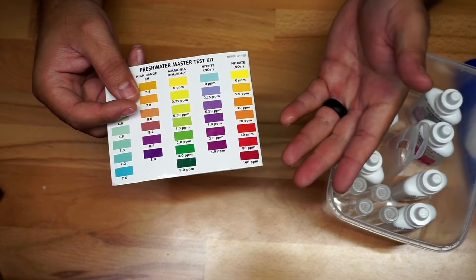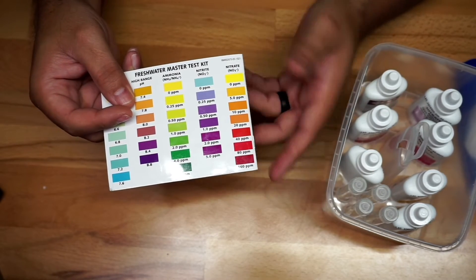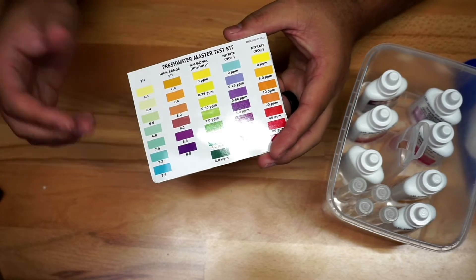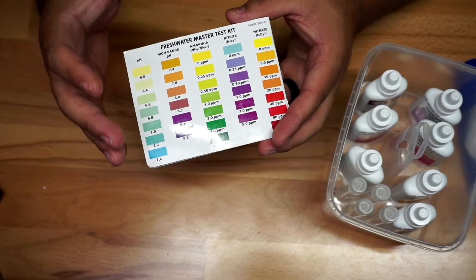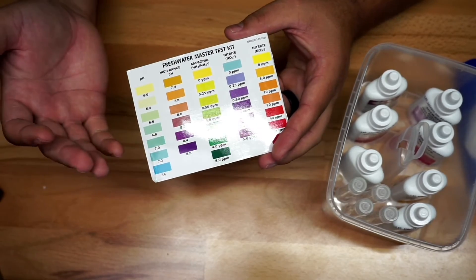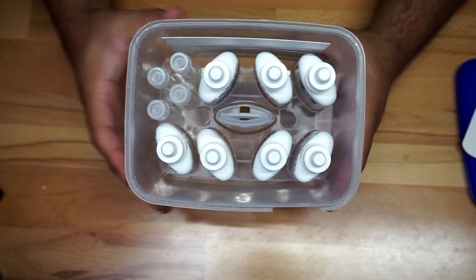It indicates if you have to do a water change and things like that. So if you have any issues with your aquarium, quickly you want to test the water to make sure that water is good to go before you go to the next step. Really cool kit, really has everything that you need.